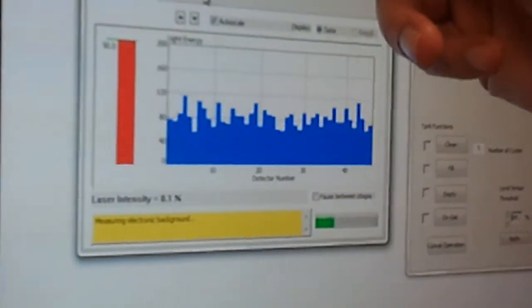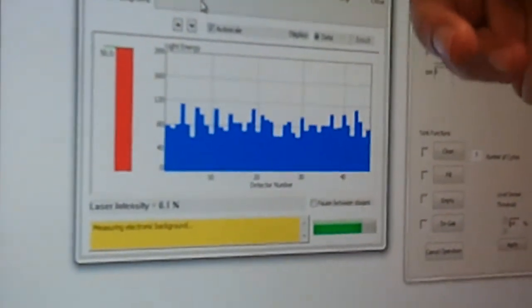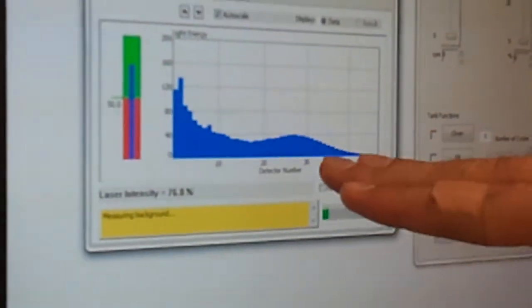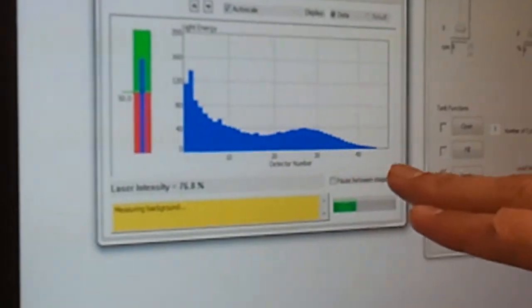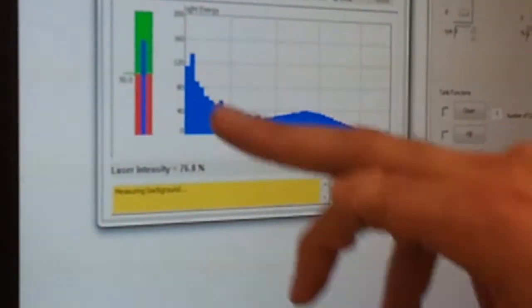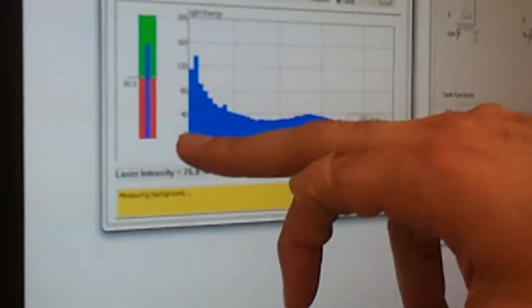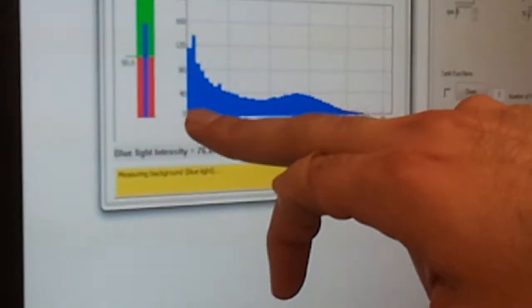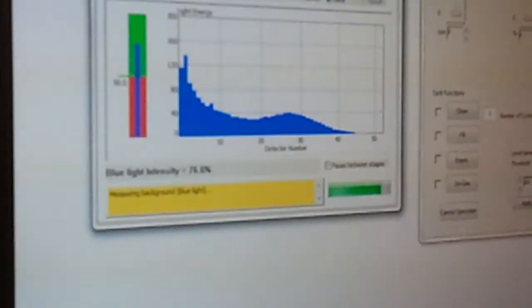So we get the background measure and then the level should come down very low here. You're going to see instead of 120, you're going to see one or two.